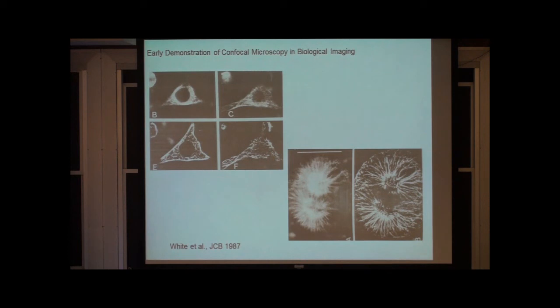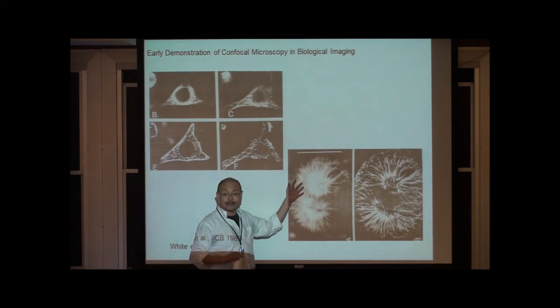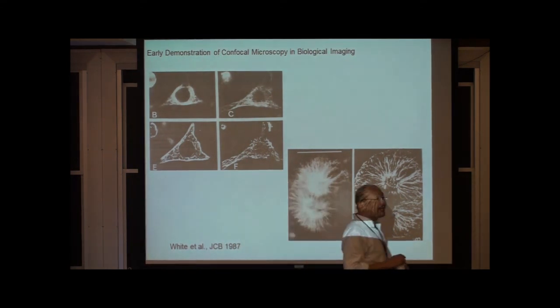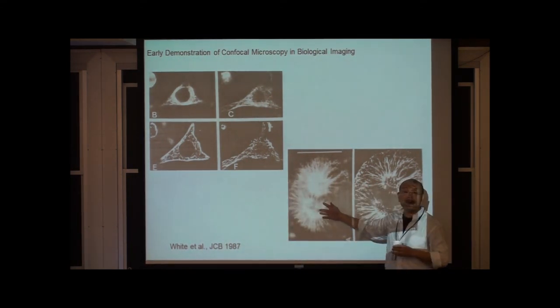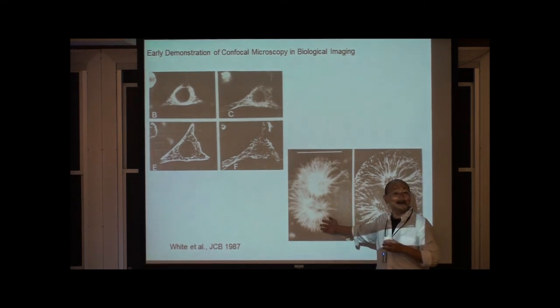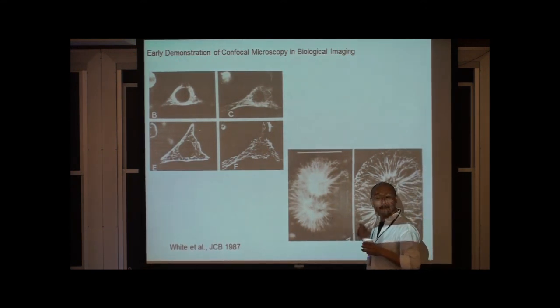And one of the things, actually, today you wouldn't think that is impressive. But on the other hand, at that time, this is, I think, a sea urchin embryo looking at the microtubules. And one can see that this is a normal wide field imaging. So at the time when they started showing the confocal image, they were showing detail that you could never see before, and people were tremendously excited.